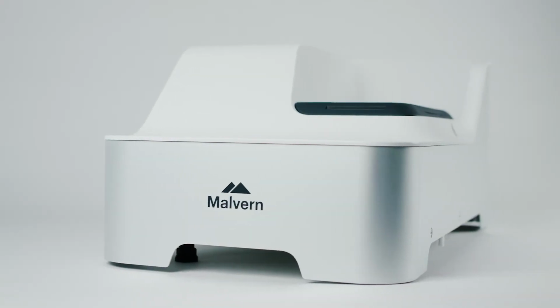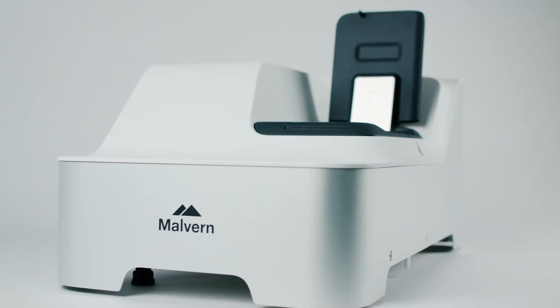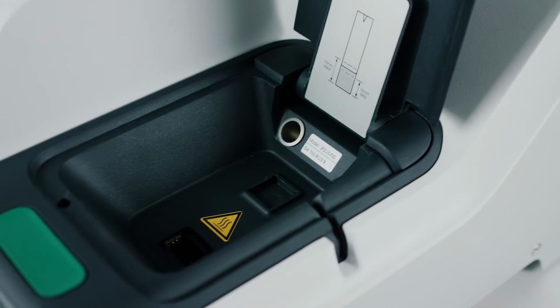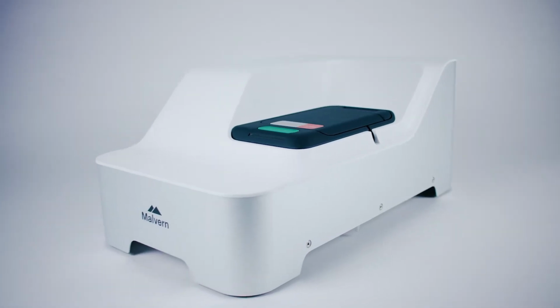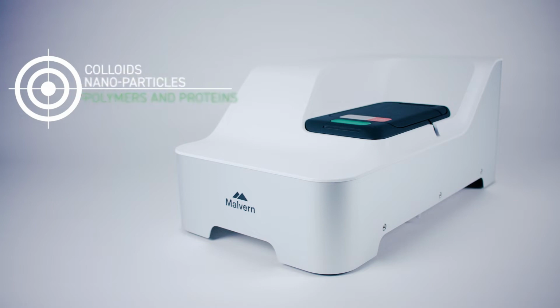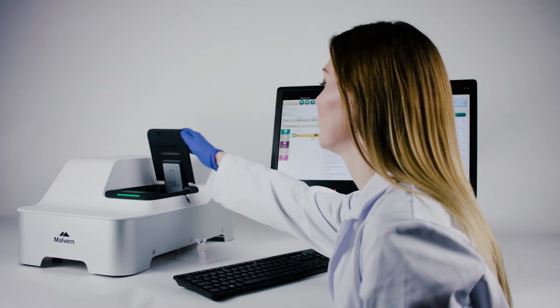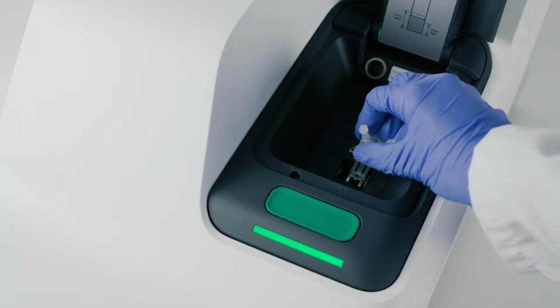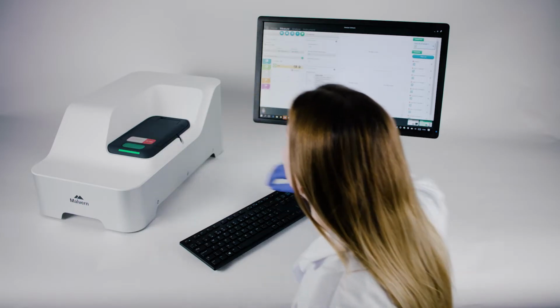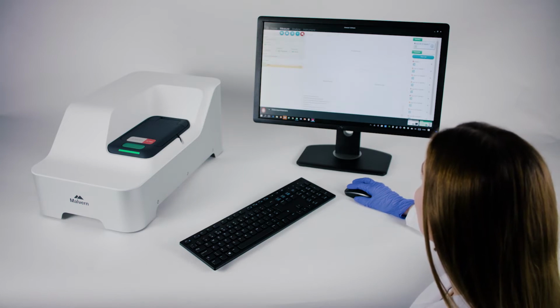The Zetasizer Pro and Ultra are the latest additions to the Zetasizer range, which combines dynamic light scattering and electrophoretic light scattering to measure the size and electrophoretic mobility, or zeta potential, of colloids, nanoparticles, polymers and proteins. Building on the strengths of the Zetasizer Nano, the new platform combines unique measurement features, hardware capabilities and software intelligence to enable novel, meaningful and robust data to be acquired quickly and easily.